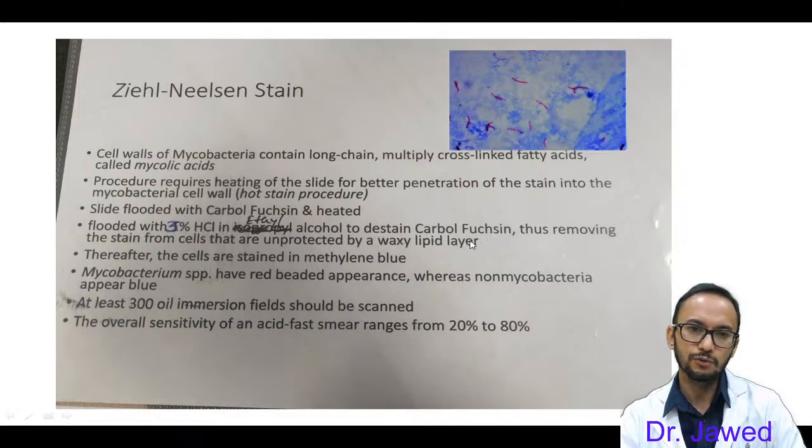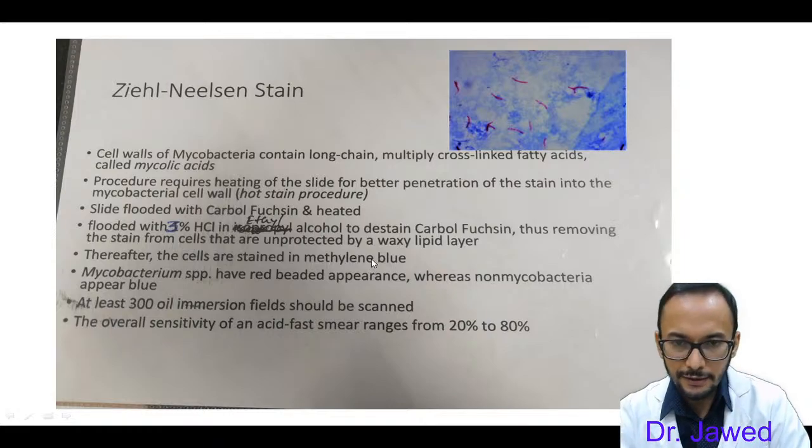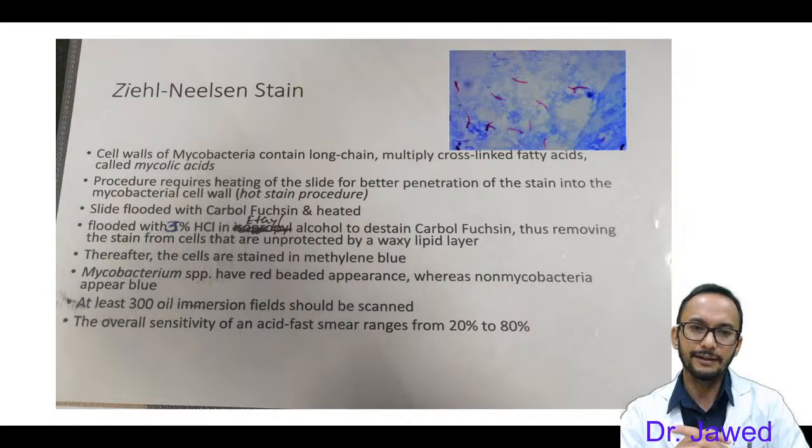After 1 to 2 minutes, we'll wash it and then stain it with the secondary stain, that is methylene blue. We'll keep this secondary stain for 30 seconds to 1 minute. After the time is over, we will wash it and see it under the oil immersion field.